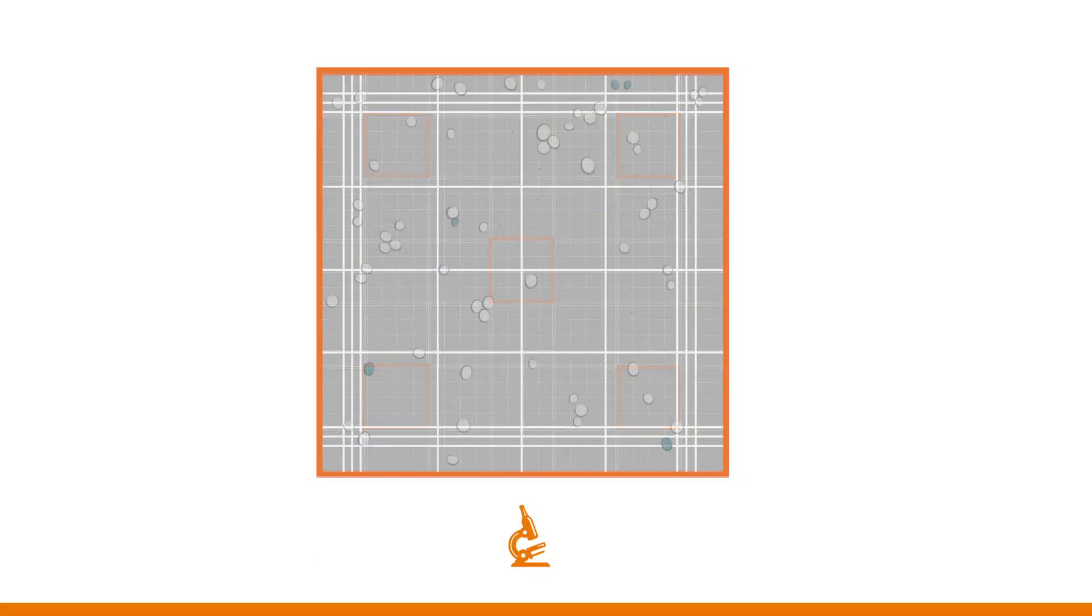These squares will appear to be a 4 by 4 grid. Count cells on 2 of the boundary lines and keep the position of these lines consistent throughout your cell count.